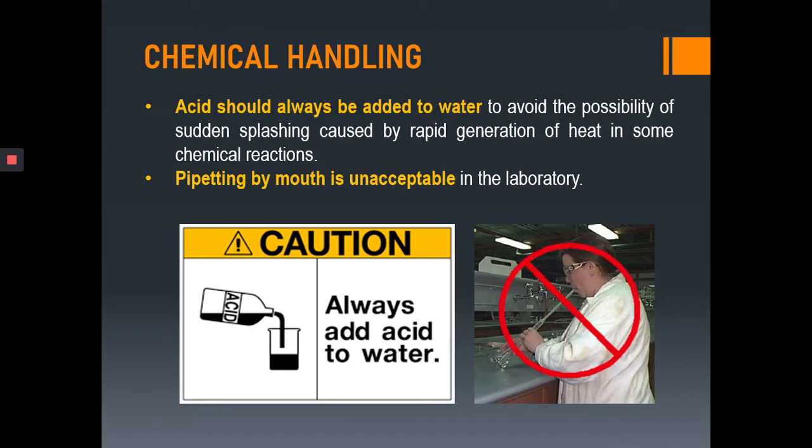For chemical handling, we have other precautions here. Acid should always be added to water to avoid the possibility of sudden splashing caused by rapid generation of heat in some chemical reactions. It's not the other way around wherein you add water to the acid. It's always acid to water.